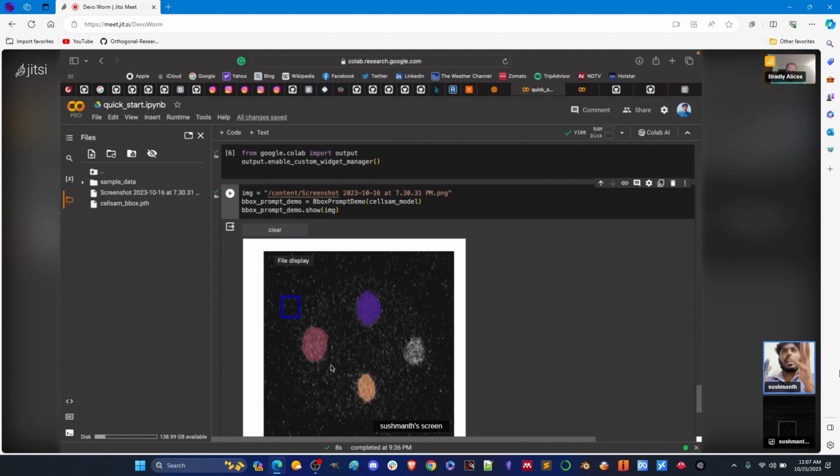But if we have a live dataset, taken right away from electron microscopy images and fed to the model, this model will work very well. If you want to analyze a protein structure, a particular cell, or an organelle, it can segment it perfectly, better than any other model. You just need to give the bounding box correctly, and it will segment it.